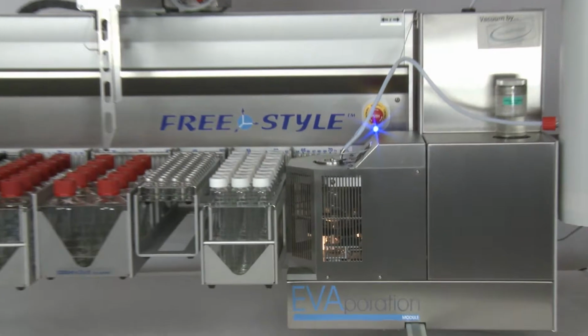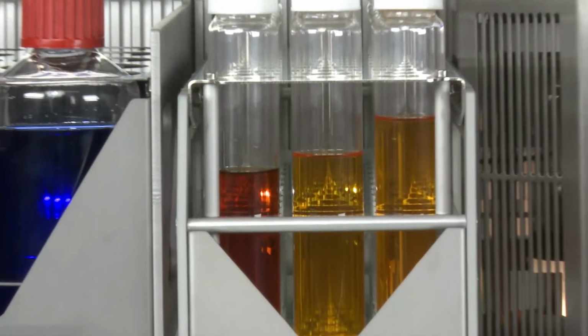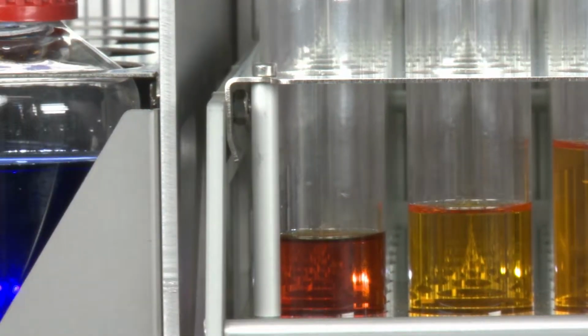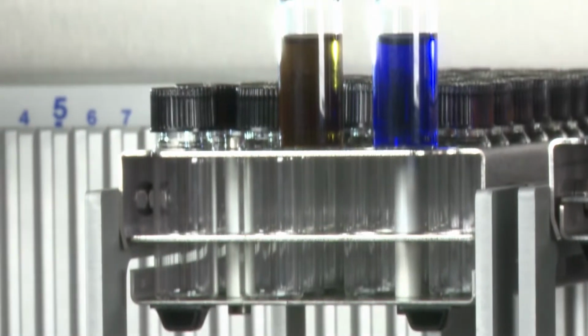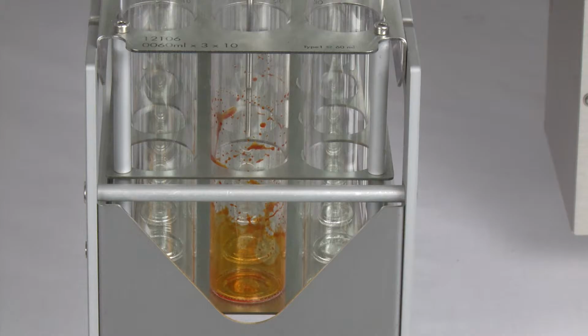The FREESTYLE system with the evaporation module has many different uses. It may be used as an automatic evaporator controlling samples with undefined volume, evaporates to a freely selectable target volume, and even rinses the sample container.